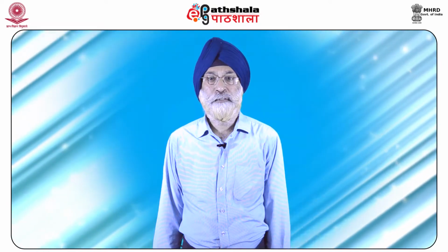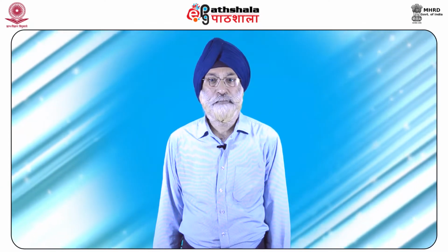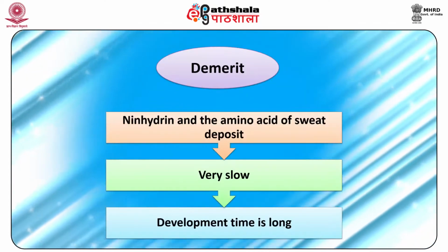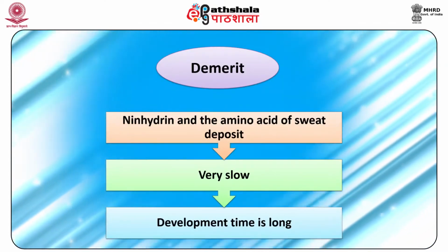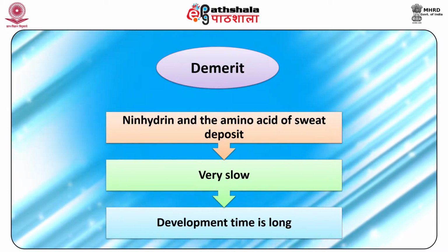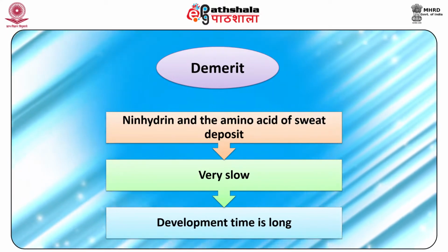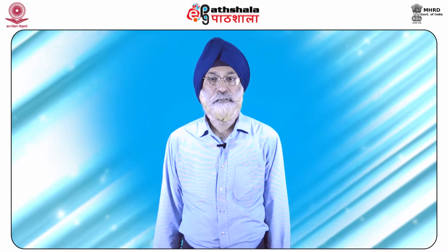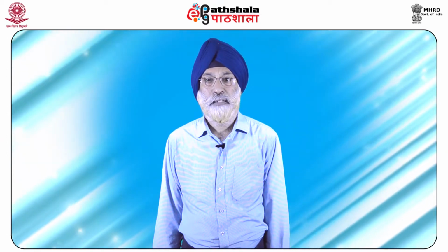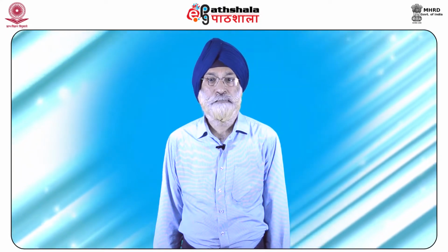Although the ninhydrin method is considered to be a standard procedure for developing latent fingerprints, it suffers from a number of drawbacks. The chemical reaction between ninhydrin and the amino acid content of sweat deposit is quite slow, and therefore the developing time is quite long. Many surfaces interact with ninhydrin, giving a strong background and coloration that makes the developed fingerprints less sharp.